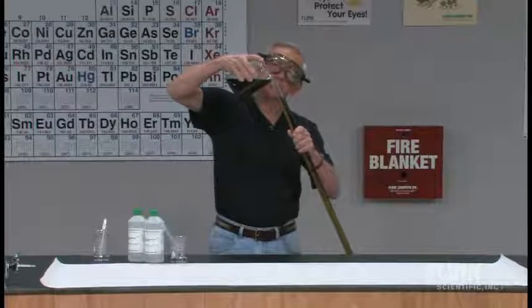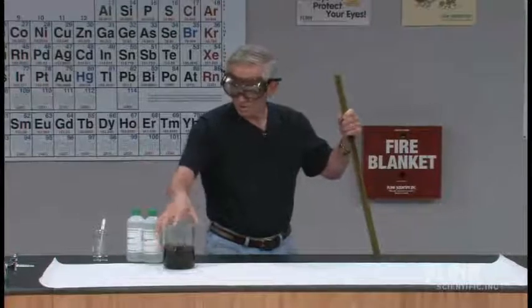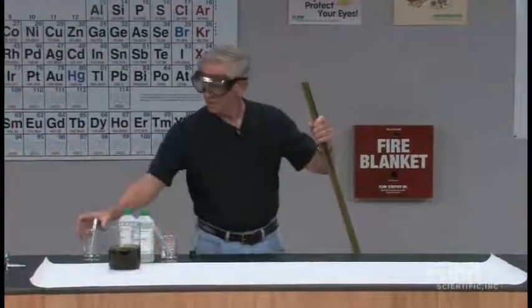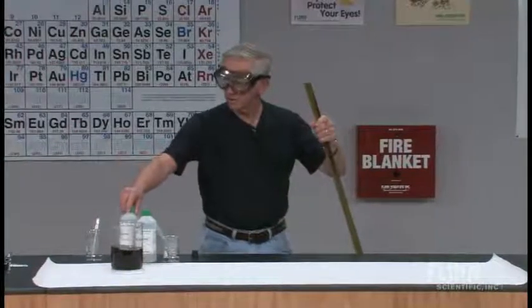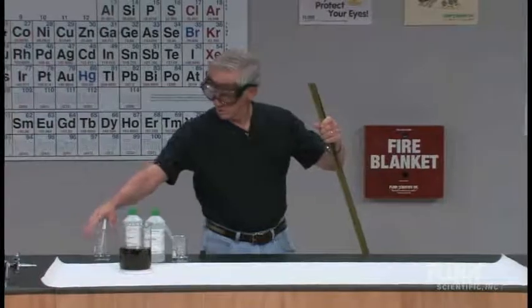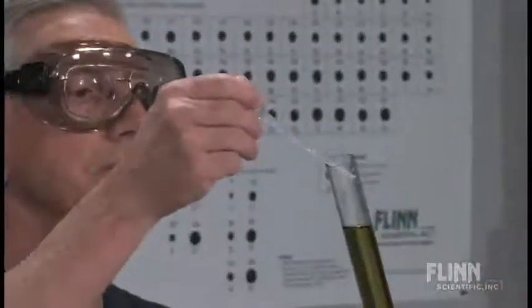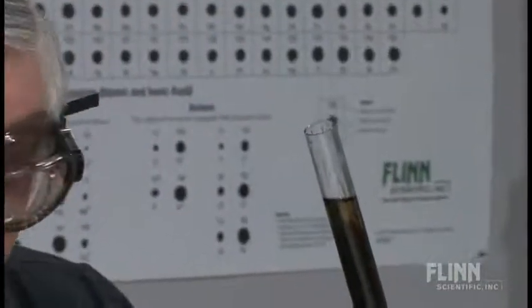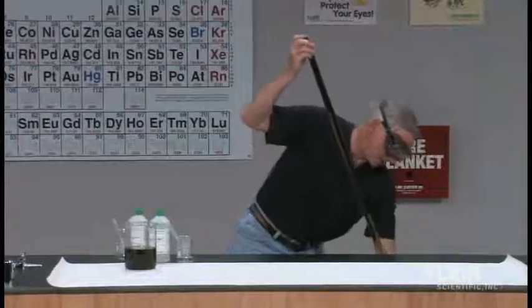What I'm going to do is put a little bit of base in one end, a little bit of acid in the other, and we'll see what happens. Here I've got sodium hydroxide, 3 molar, a little bit in the beaker. I'm going to put some in this end. And right away we see a purple color, typical of the base form of universal indicator.